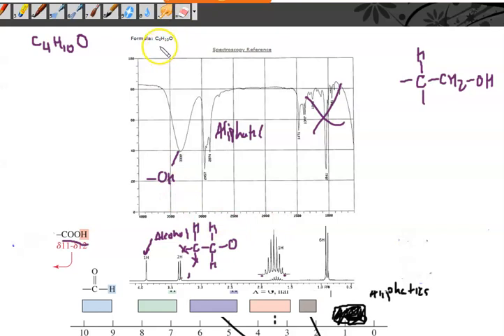So I've accounted for 2 of the carbons, 4 of the hydrogens, and the oxygen. That leaves C2H6. If I split it up between 2 different groups, that's a CH3 and a CH3. You can analyze this however you want. At this point, obviously, this is a CH3 and a CH3, just based off taking what I already have minus my formula and piecing it all together. But we should go back and double check just in case.